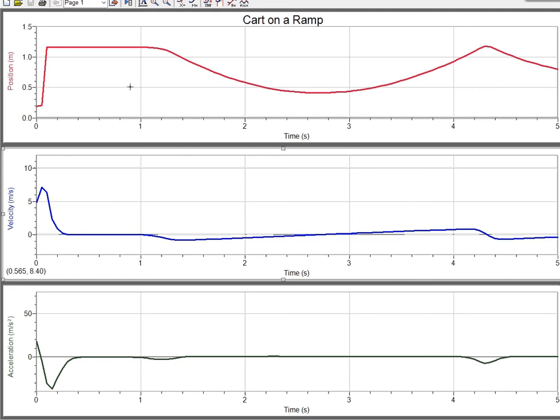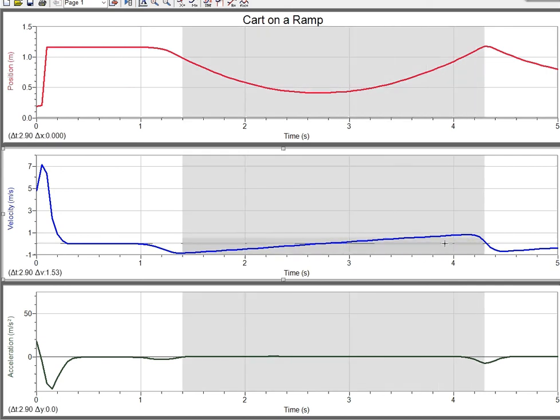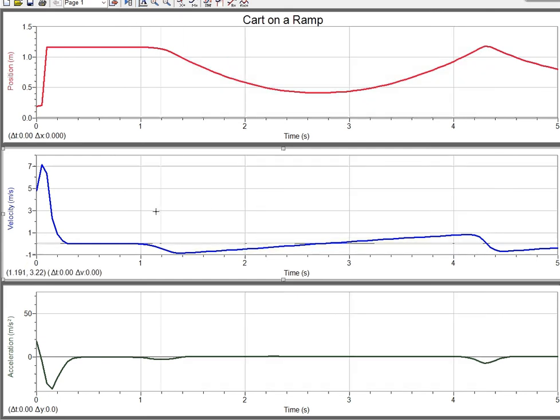Now, once I've got these on there, I could go up and auto-scale these right here. If I want to auto-scale the graphs, see what I'm saying? It'll auto-scale based on the range of values, so it spreads them out as wide as possible. I think if I do something like this too, like if I were to click that and go auto-scale, oh, never mind. Doesn't do that. Oh, well.